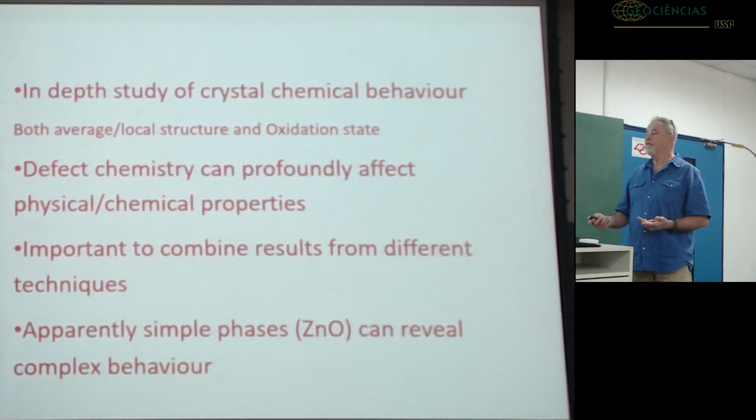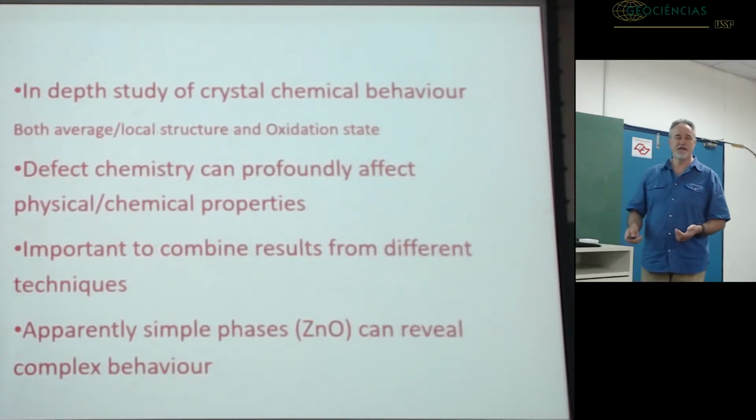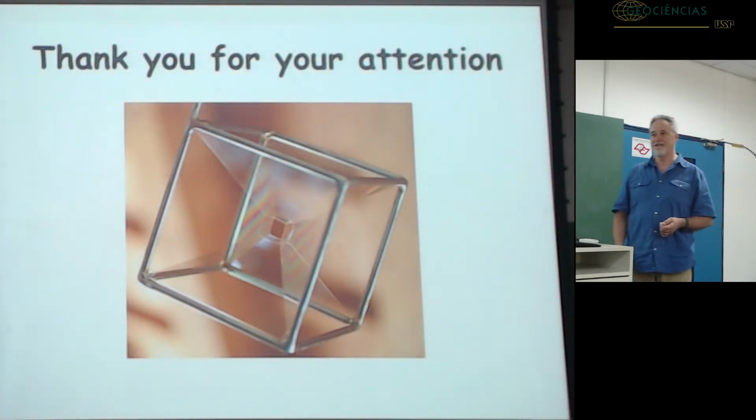So in that sense, combining different kinds of techniques, long-range order techniques like diffraction, and short-range order techniques like X-ray absorption spectroscopy, can reveal unexpected complexity that we didn't dream about. And thanks for your attention.